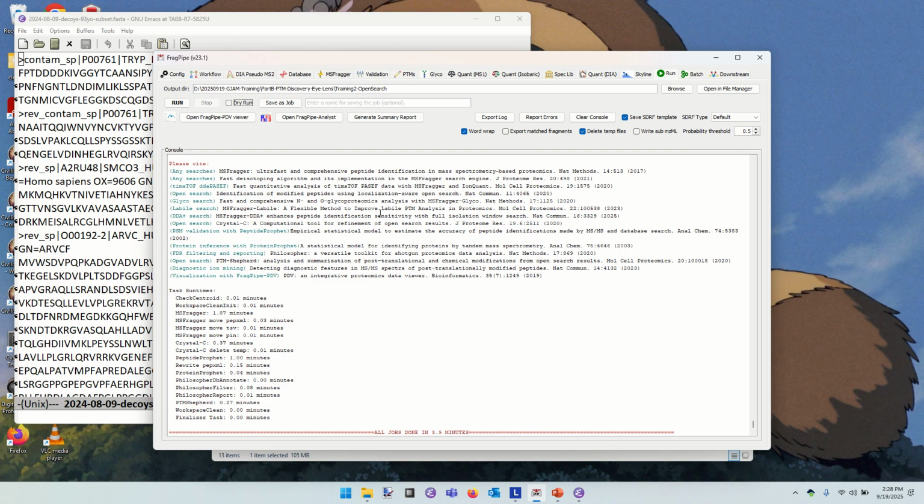23. Wait, is that the atomic mass or the mass shift? That's the atomic one. Okay. So the 23 replaces a hydrogen, or a proton, I should say. Therefore, plus 22 is the gain, reflecting an addition of a sodium ion instead of a proton. Whenever you have competing explanations for why the mass shift is seen, the most trivial, most boring one, the one that prevents you from getting a Nature Biotechnology paper, that's the right one.